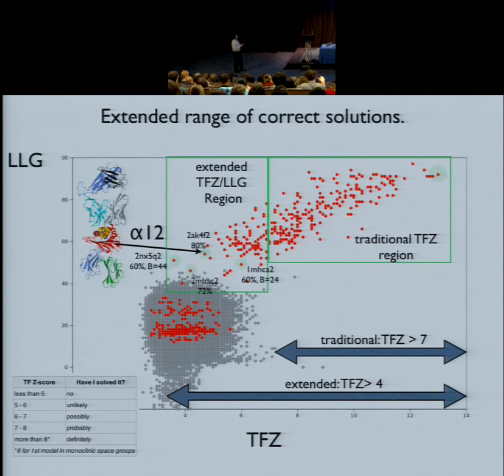So do we need to run many cases? Do we need to run cases that fail? And potentially, you've heard in the previous talk there are ways to limit, et cetera. But in this case, what we gain from running those cases which don't converge or are false, without doing the complicated calculations that Randy mentioned yesterday, is that we get the boundary, or the level, for the particular structure of what is correct and what is incorrect LLG. So from this search, you can see that maybe around 37, 38 is a cutoff for what could be potentially interesting for the structure determination.